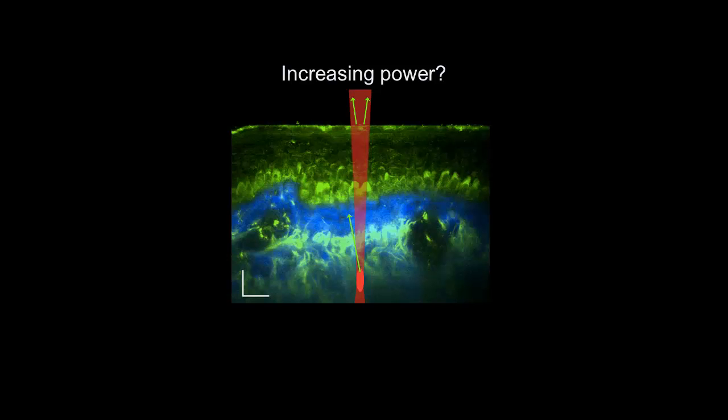The phase is really dictated by the phase of the incident light, so it has a well-defined direction of propagation. It propagates in the forward direction, but what we collect in the backward direction, we usually collect the photons that are scattered back. So you can collect both in the forward and the epi direction.